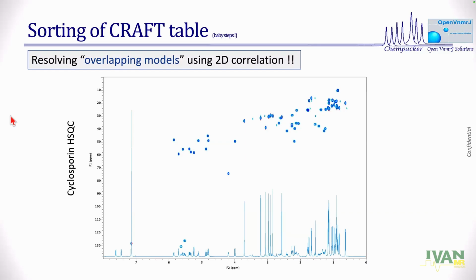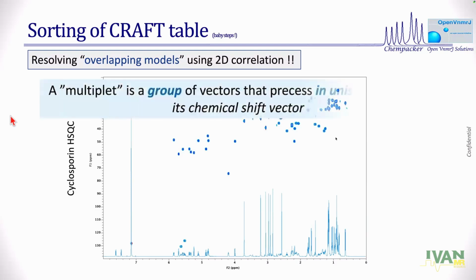But let's just first take it with HSQC. Here is a 1D spectrum. That's a 2D spectrum. I don't think it requires an NMR spectroscopist to say that the signals are well resolved. I think if you show it to anybody, they'll say, oh, yes, of course, I have two dimensions. That's exactly what we have been doing for several years. And we connect the dots and do our structure, do our computations, whatever we want to do. So that's potentially a way out.